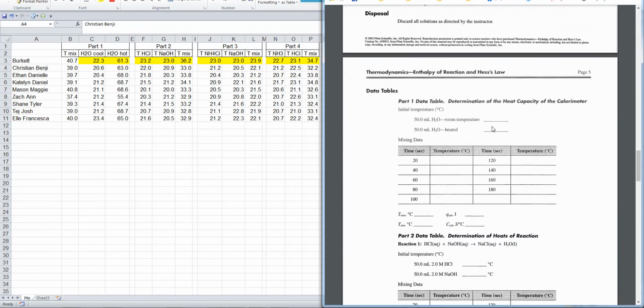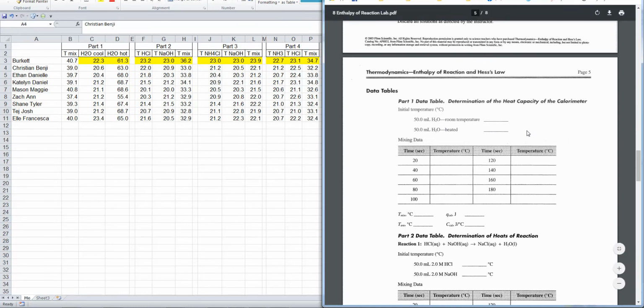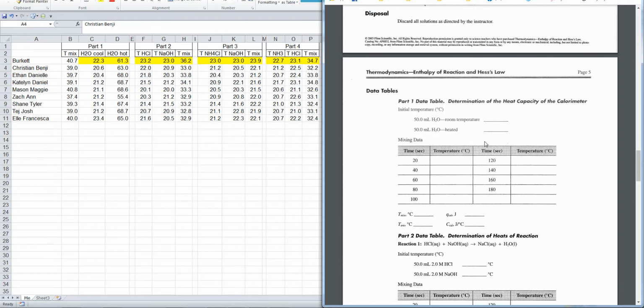So as far as data tables go, here is your data on the left-hand side, and here's your stuff over here on the right. Simply, hot and cold water are these columns C and D, all right?